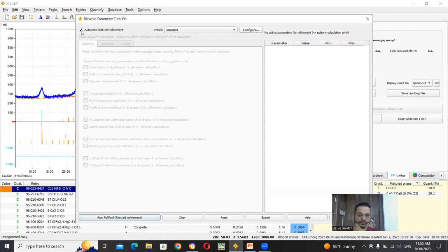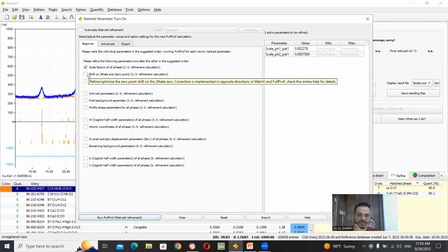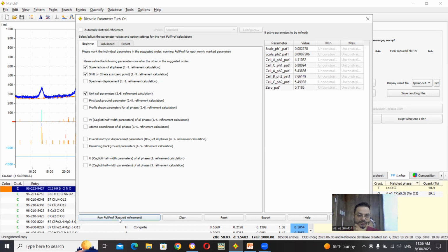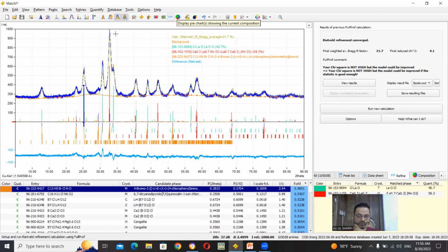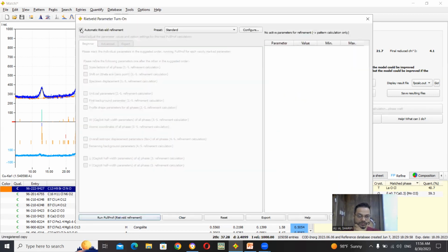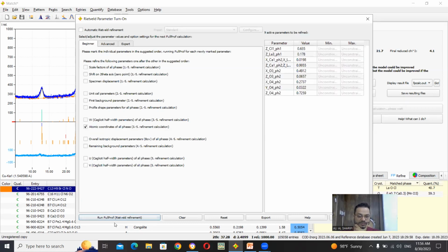Okay, FullProf, automatically, no, beginner. Let me start selecting scale factors, shift of 2 theta, unit cell parameters. Okay. Not very well. Let me work on atomic coordinates of all phases.